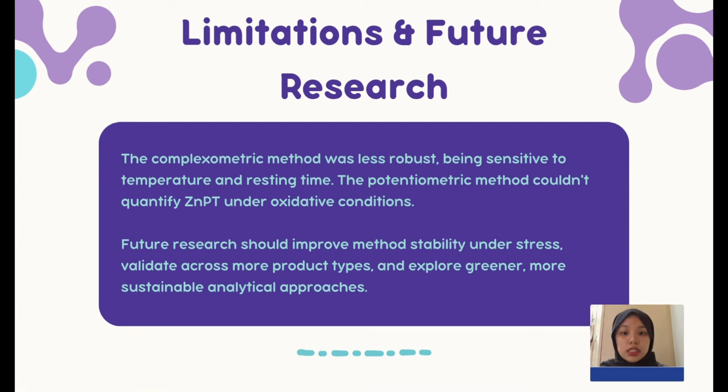For future research, we recommend expanding the method validation to include a wider variety of zinc PT containing products such as leave-on treatments or conditioners. Further investigation could also explore method automation or integration with portable devices to support rapid on-site testing. This will enhance overall efficiency and broaden the industrial applicability of the technique.